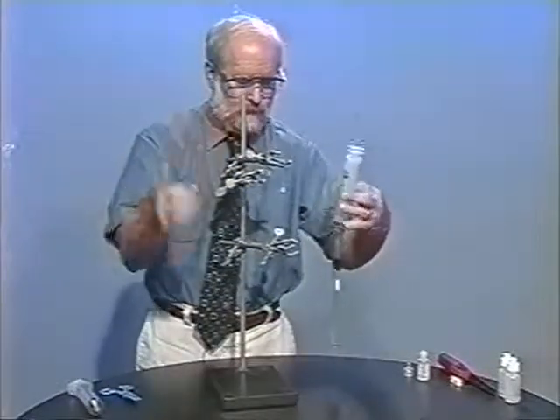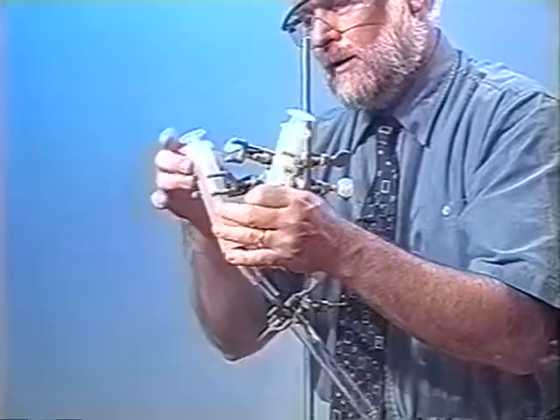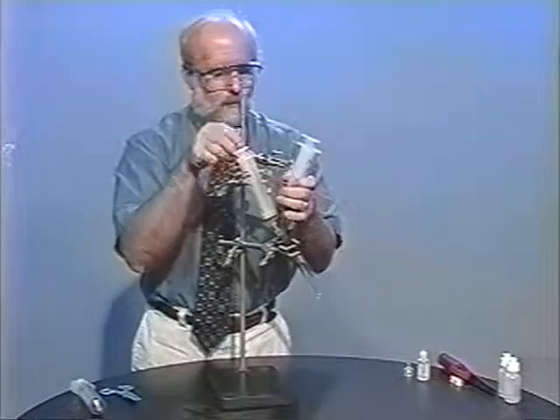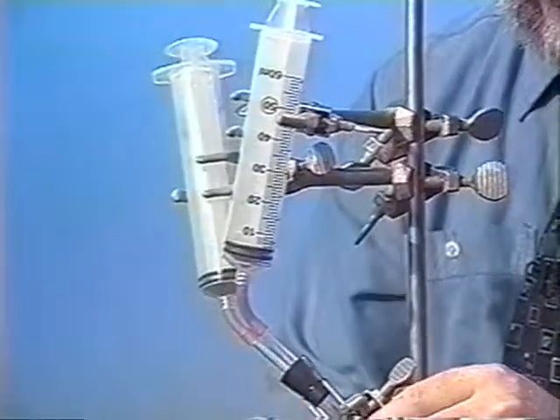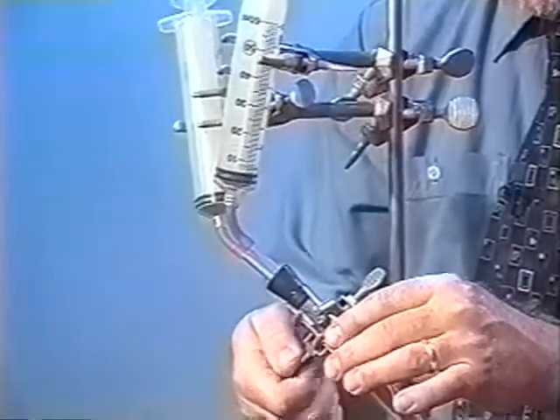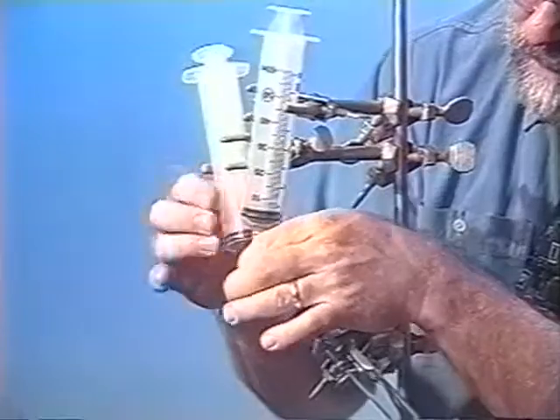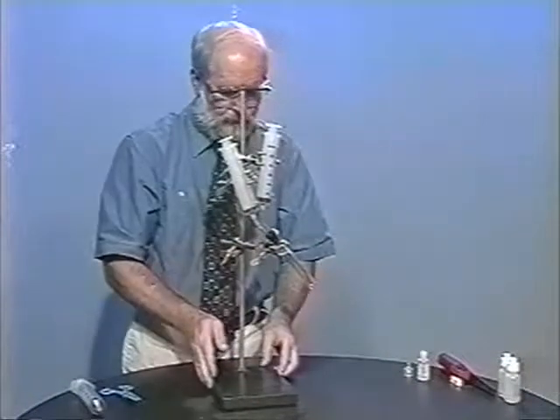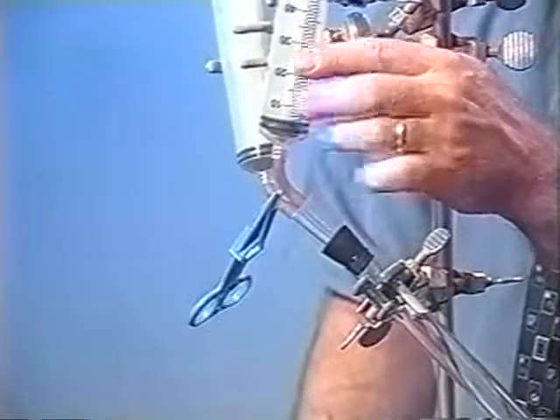We need a ring stand to hold the device, and the test tube will be clamped there. The syringes shouldn't be tightly clamped, only loosely clamped, because plastic can be squeezed and then the plunger can't move in the barrel. So I just clamp it very weakly. The test tube is clamped tightly up near the stopper. Eventually we'll put the reagents in there and make sure all the fittings are nice and tight. Then we'll put the hemostat on this tubing, making this the waste syringe in this demonstration.